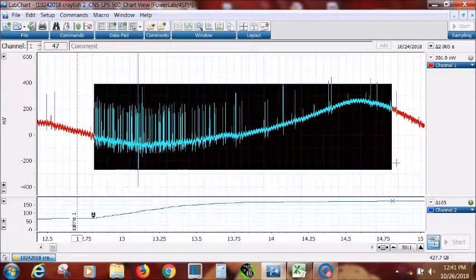So now you see that there's 105. It's really 105 down here. When I go to 2 seconds, that's up here. I go to 2 seconds about there, there's 105. So that means from the marker to this value, we have 105 spikes. Okay, we can remember that, right?